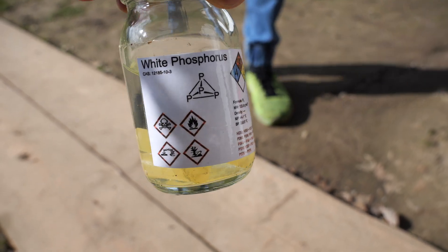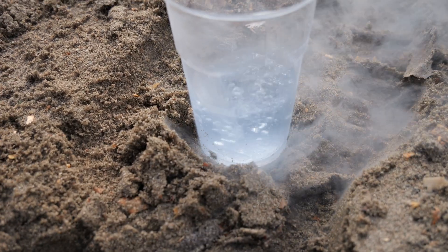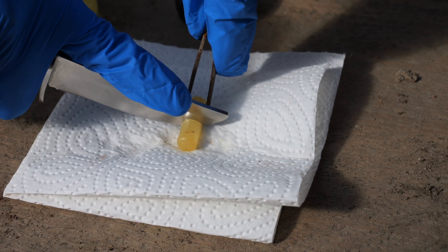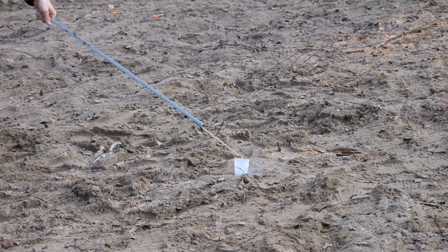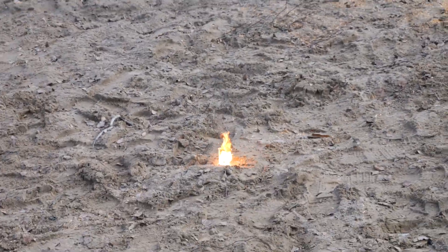Today we are going to show you a high speed synthesis of phosphorus pentoxide using white phosphorus, red phosphorus and liquid oxygen. We began by cutting off some white phosphorus which was then put into a plastic cup alongside some liquid oxygen. We lit it on fire and as you can see the oxygen is doing its job fairly well.